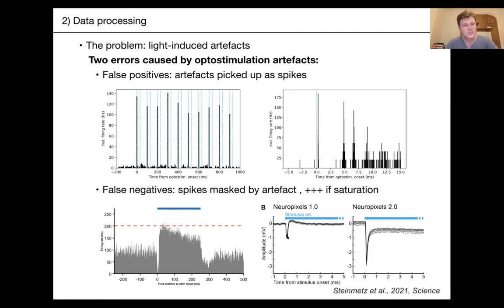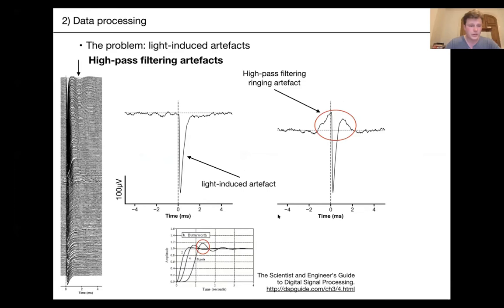So what can we do to handle artifacts? The first approach is median subtraction, also called common average referencing or CAR. This gets rid of noise shared across channels — for example, 50 Hz power supply noise that's correlated across every channel. Since no neuron fires correlated across every channel, you can subtract it off and recover your data, as long as it's not saturating.